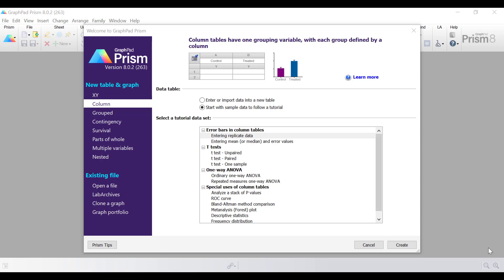By just a few simple clicks you can get a wealth of information back from your data to give you a snapshot of the data as a whole. Examples of descriptive statistics include the mean, the standard deviation, the standard error of the mean, and this can extend to the quartiles — the 25th and the 75th centiles — as well as the median value. There's also the coefficient of variation, which gives you an idea of the variation of your data. There are also more advanced descriptives including the geometric mean, the harmonic mean, and the quadratic mean — these are different types of means as opposed to the conventional arithmetic mean. And there's also data that will give you an indication of the distribution of your data, for example the skewness and kurtosis.